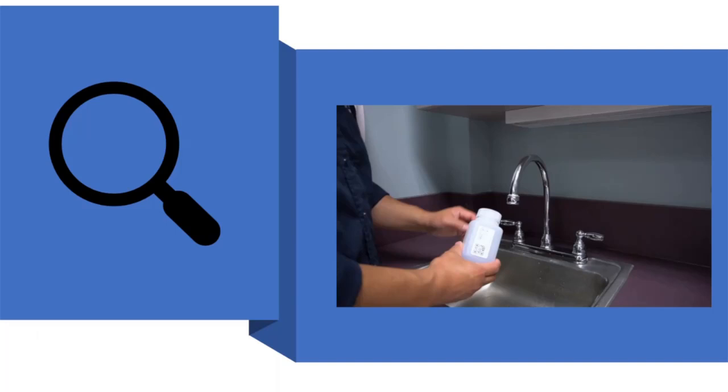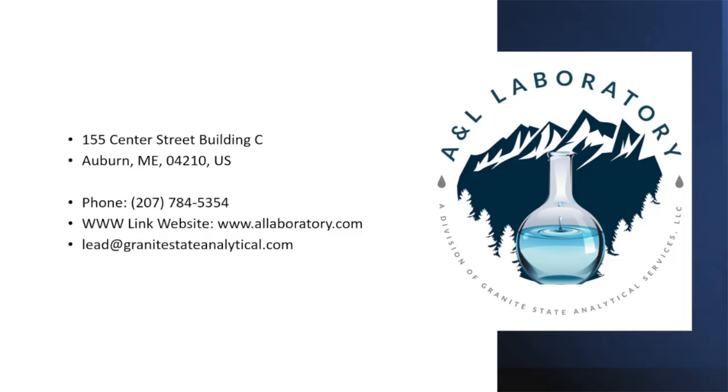Once the decision has been made by your school to begin lead remediation and mitigation efforts, further investigatory samples may be needed. Follow the sampling protocol to more specifically determine where lead is located in your building's plumbing. The Lead Remediation and Mitigation Guide, provided by A&L Laboratory with your original sample results, may also be referenced as you enter this next phase. There are 3 types of investigatory samples, which will be described in more detail later in this video.